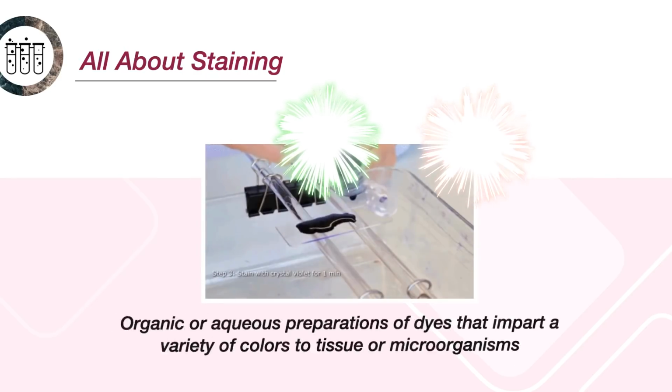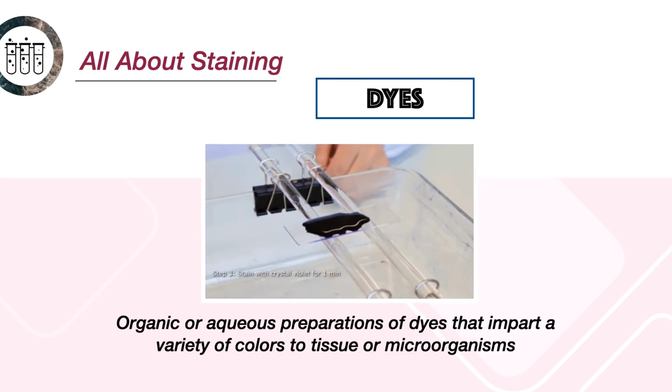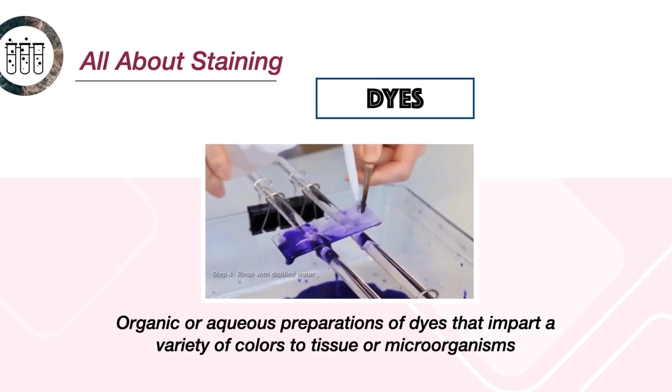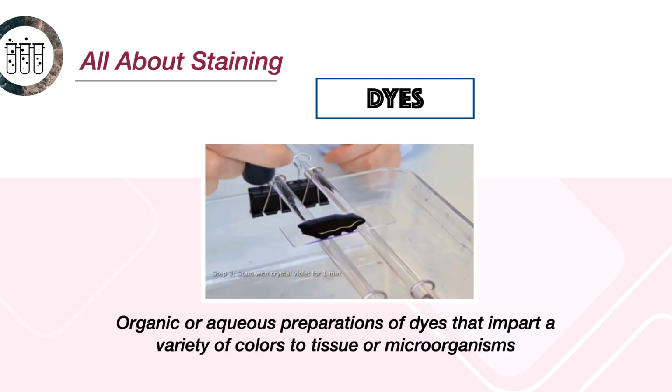So, what really are stains? Your stains, otherwise known as dyes. These two terms can be used interchangeably. These are organic or aqueous preparations that impart a variety of colors to tissue or microorganisms. Staining allows the bacteriologist to further enhance the visibility of the microscopic bacteria.